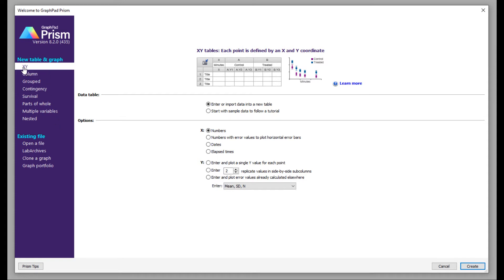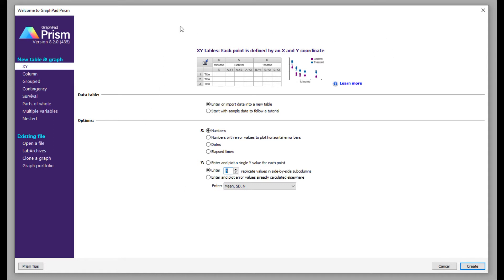Let's start with XY. In XY, each point is defined by an X and Y coordinate, so if your data has two coordinates you can plot your data using this setting. You need to provide the different replicates for your Y coordinate. If you have multiple replicates — for example three, four, five, or six — you can enter all those replicates and you will have the option to add them to your plot.